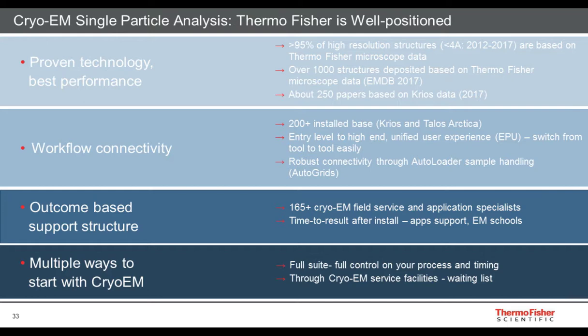Cryo-EM is very useful when it comes to looking at protein complexes, large molecular assemblies, whereas XRD is very good and dedicated to looking at the building blocks of life, and NMR probably at the flexible domains. So, no, it will not replace them. Cryo-EM will, I think, be a nice complementary addition to the existing technologies.